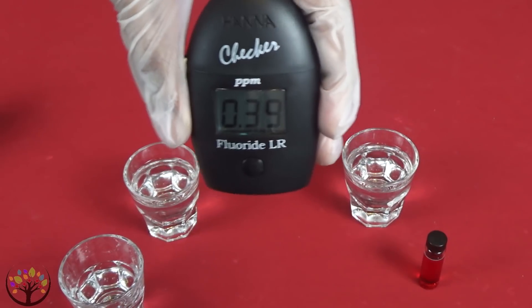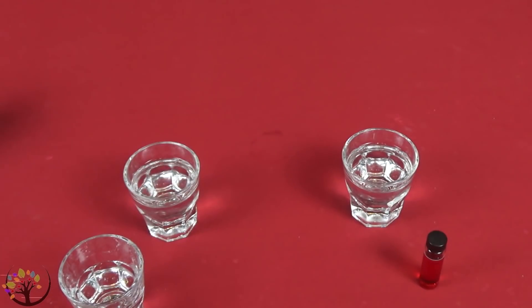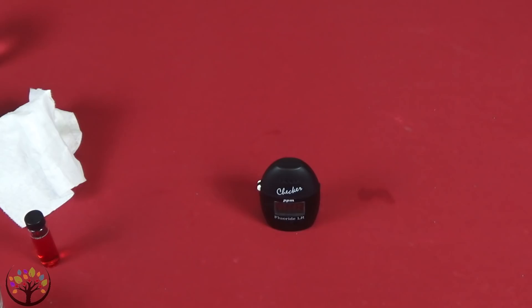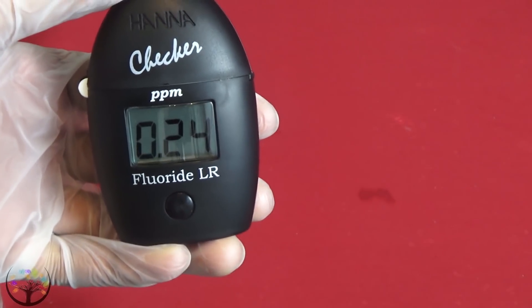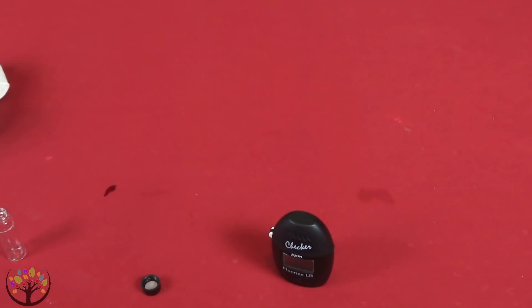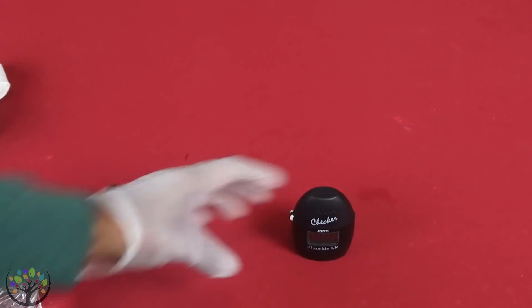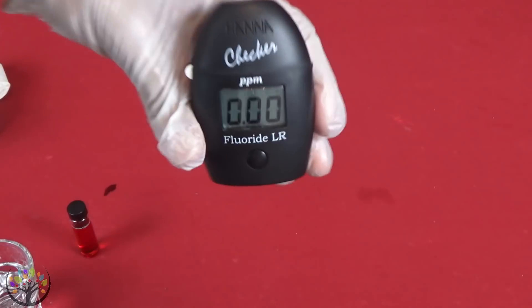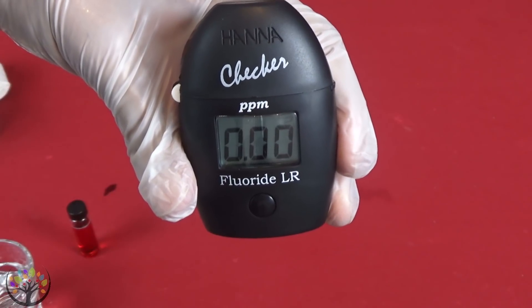0.39. I don't know how good or bad that is — we'll have to do some research and figure that out later. So now I'm going to test the tap water. 0.24. So according to this, there's more fluoride in the sun energized water. So I decided to use some new sun energized water and test it and see what it tested at. I got a reading of 0.00, which is obviously good. I wanted to retest it again just to make sure that reading was accurate.